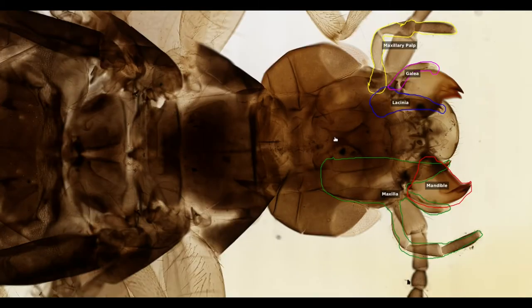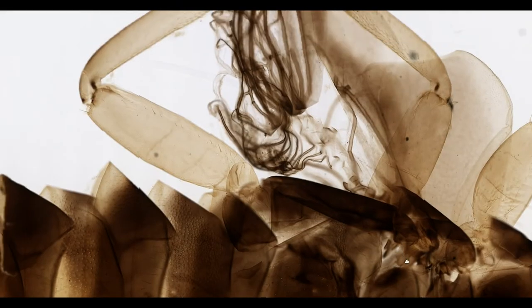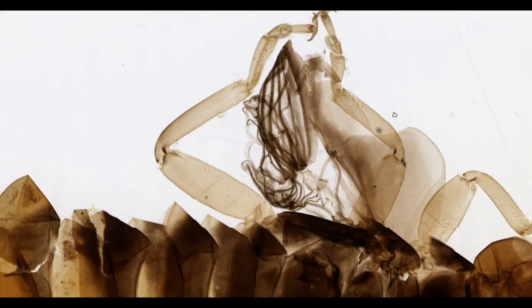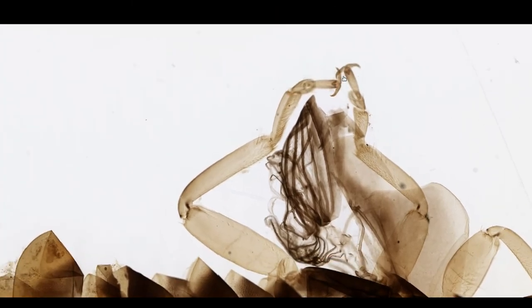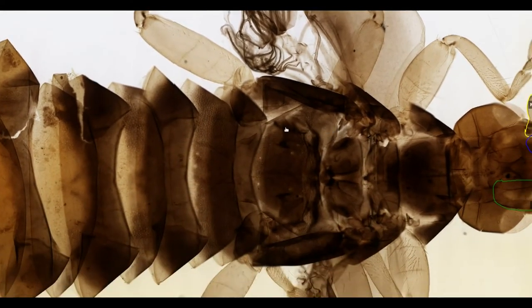So let's move on back to look at some of the other good anatomy that we can see on this slide. It's all fairly bog standard insect anatomy: three pairs of legs with sensory hairs and hooks at the end attached to a thorax with an abdomen behind. However, here are the wings of an earwig.